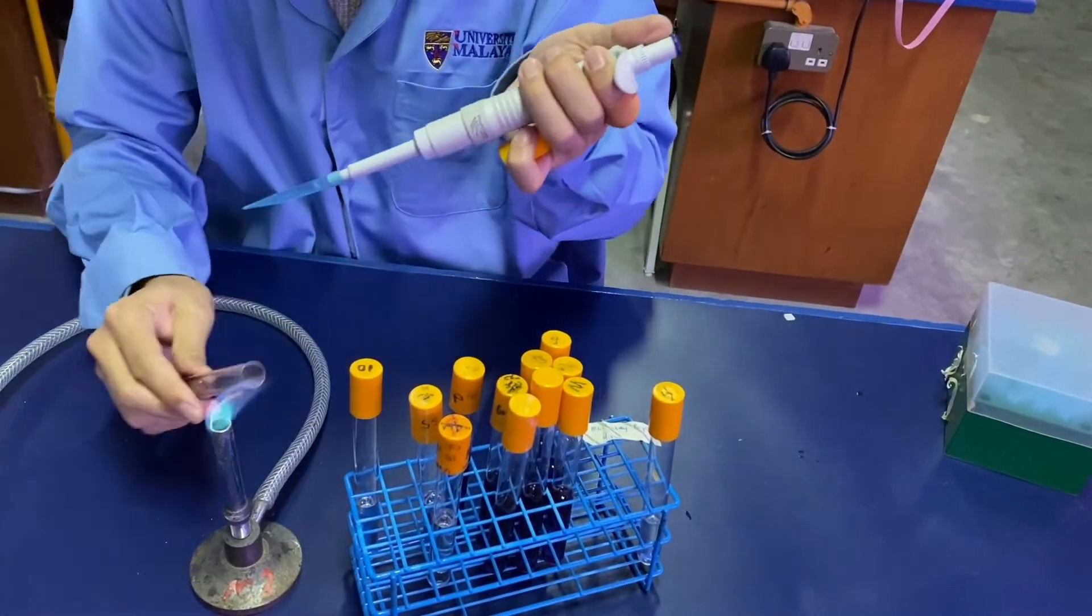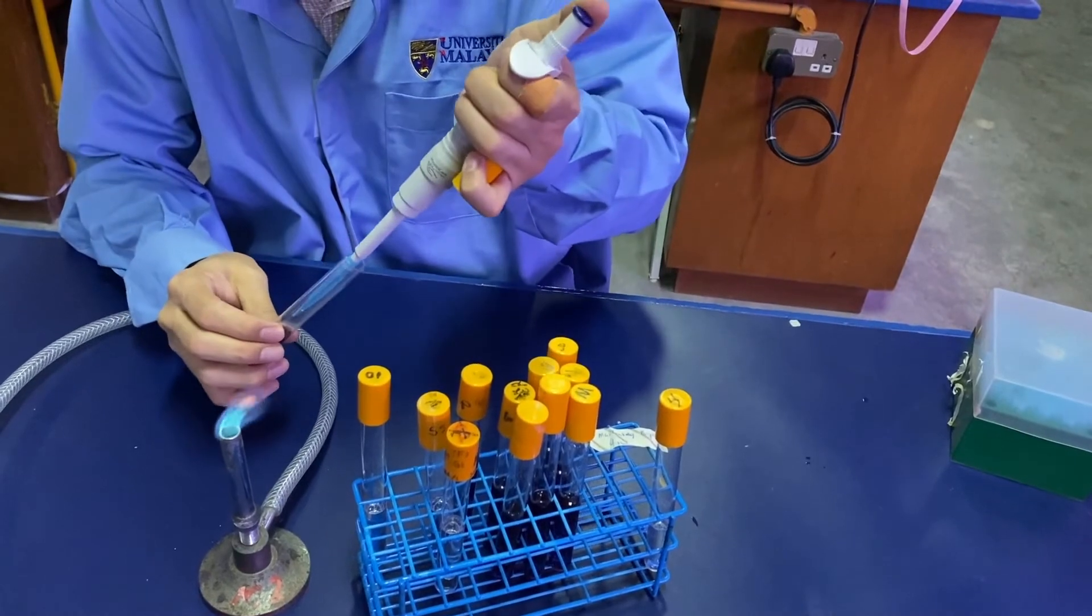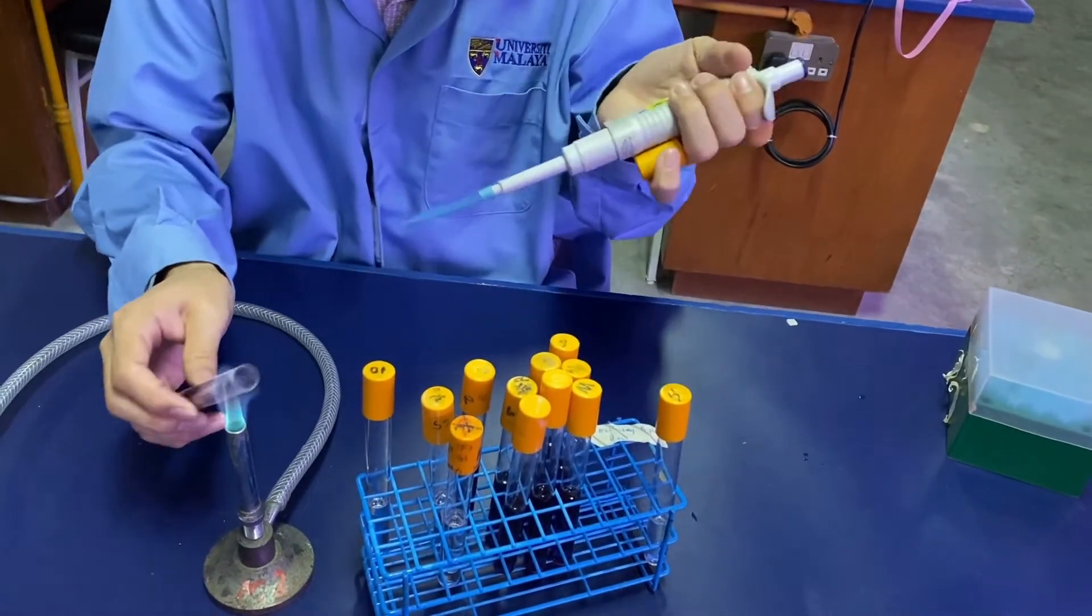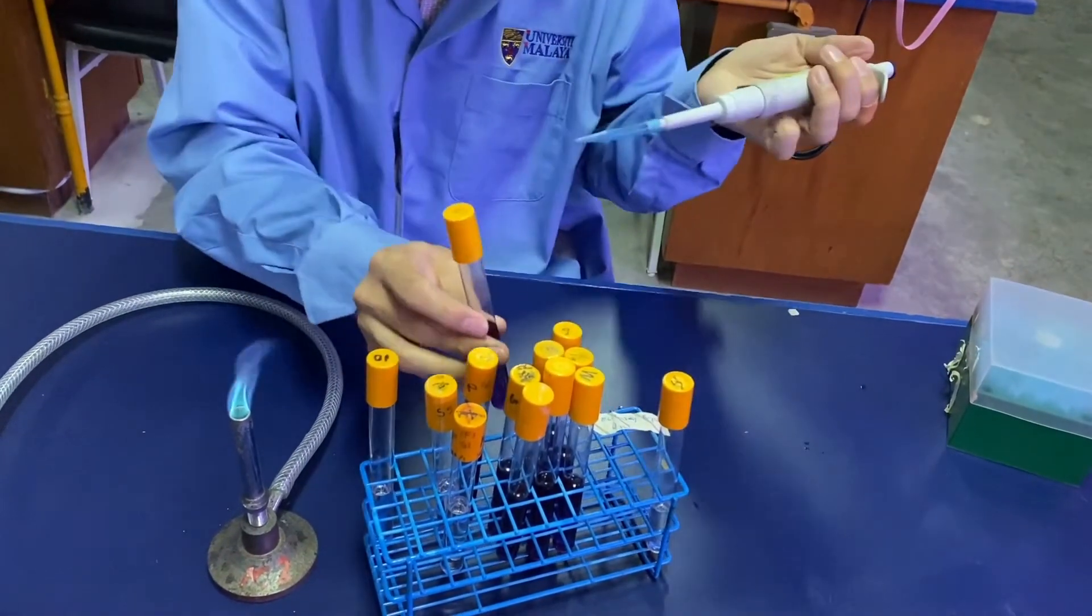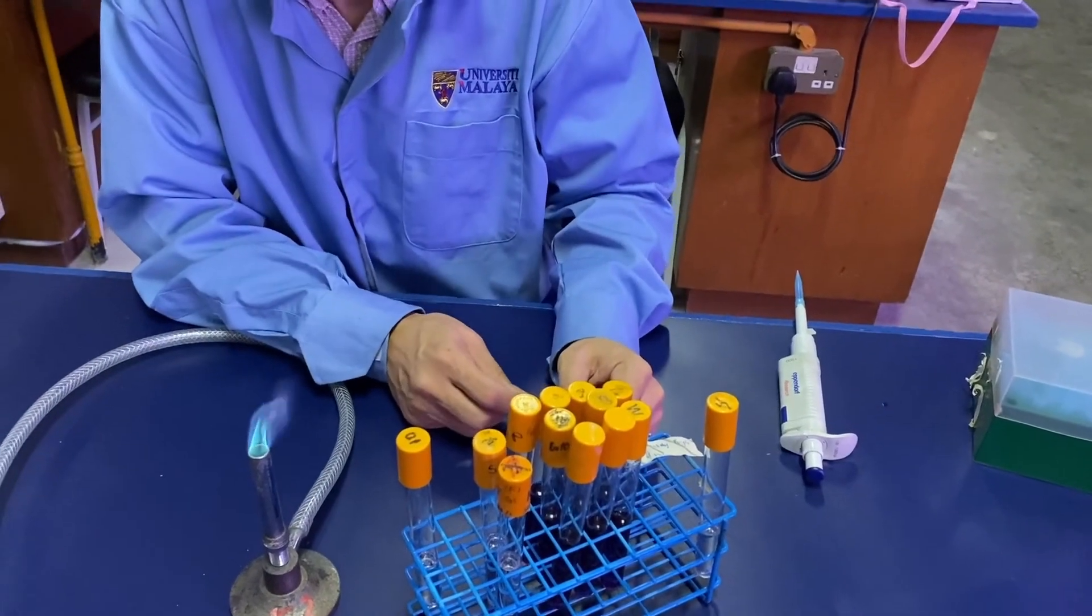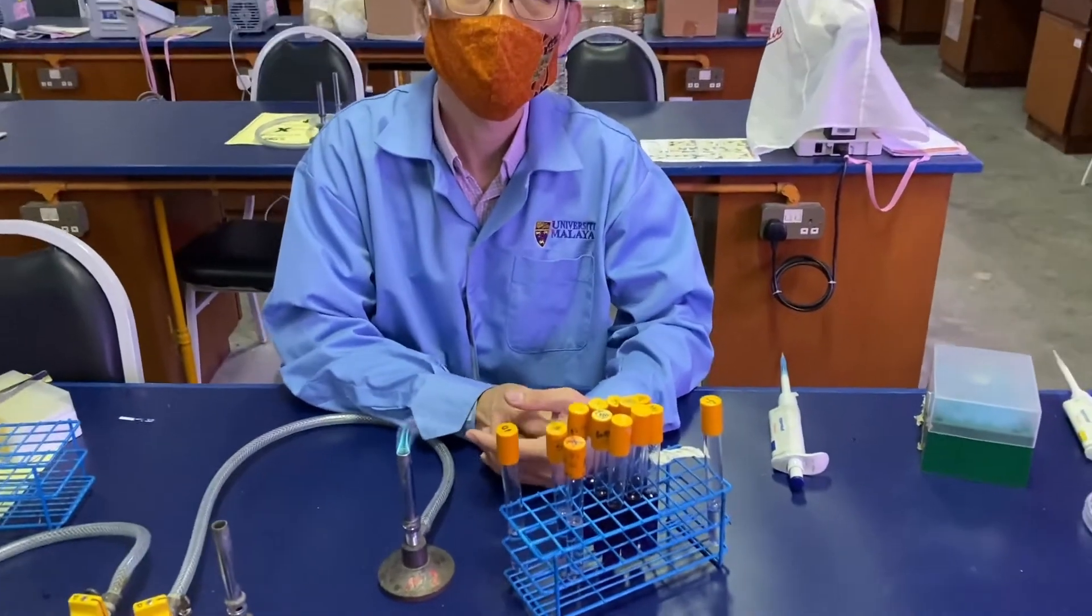One milliliter each from the sample tube to the MPN tube. Once you've done everything, you can incubate them.